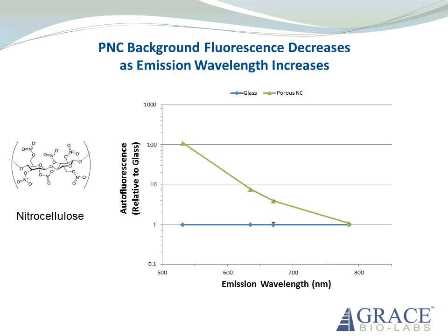In fact, nitrocellulose also has a double bond, so one would expect that nitrocellulose has an inherent native fluorescence, and it does. When PNC is used as a film for microarray assays utilizing visible light fluorophore markers, the native background fluorescence is easily detected. This background is generally referred to as autofluorescence and leads to a practical lower limit of detection. Now this limit is only realized at extremely low levels on glass surfaces, so from this perspective, glass should be a preferred surface and generally is.